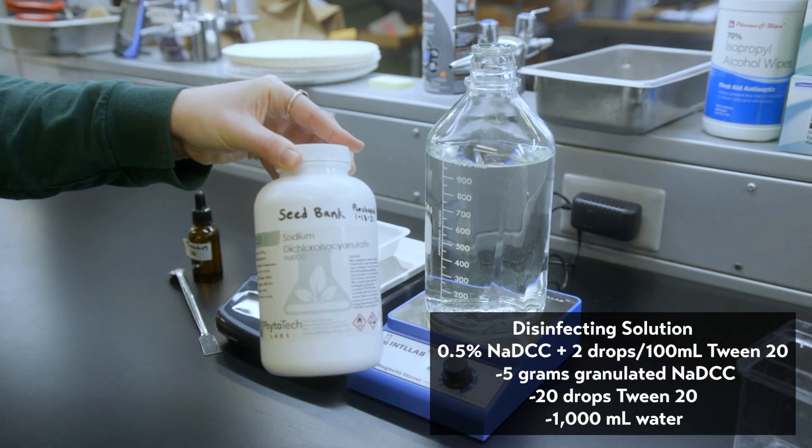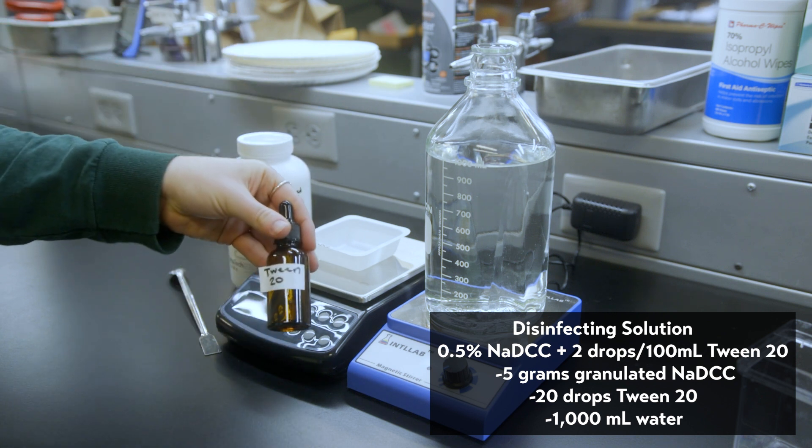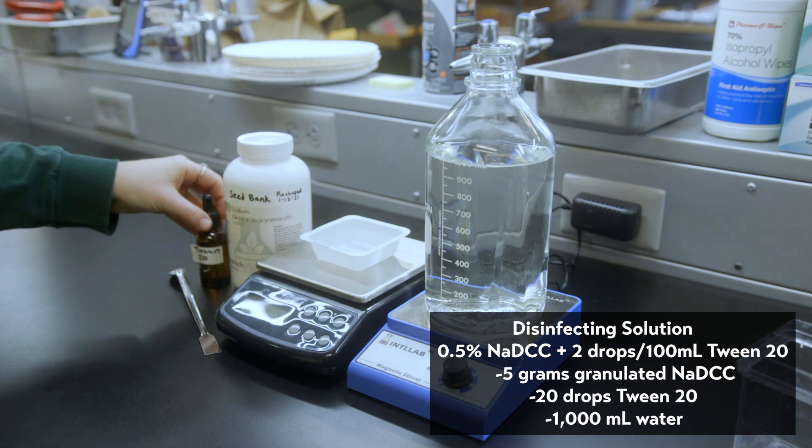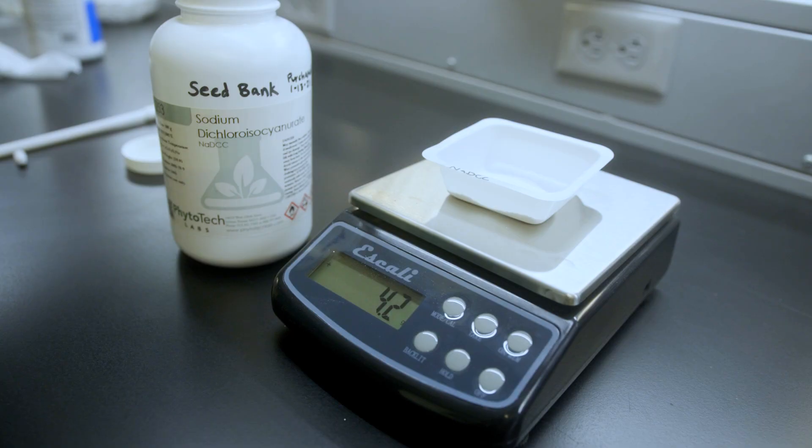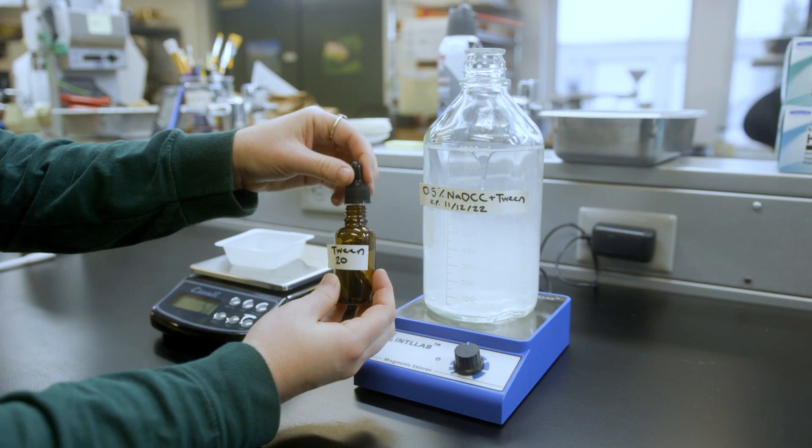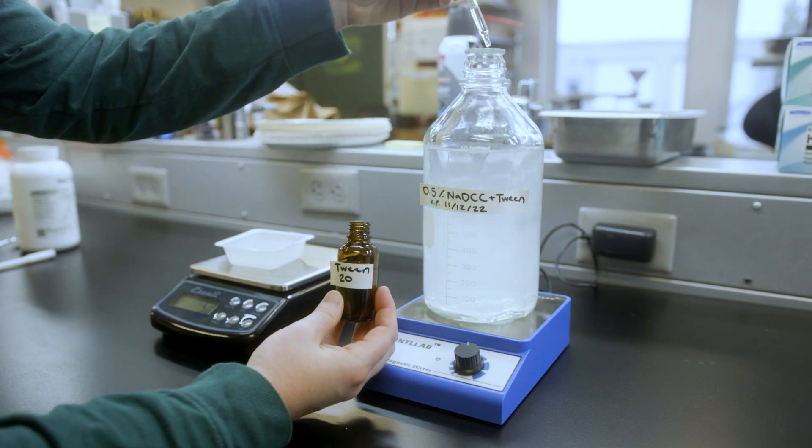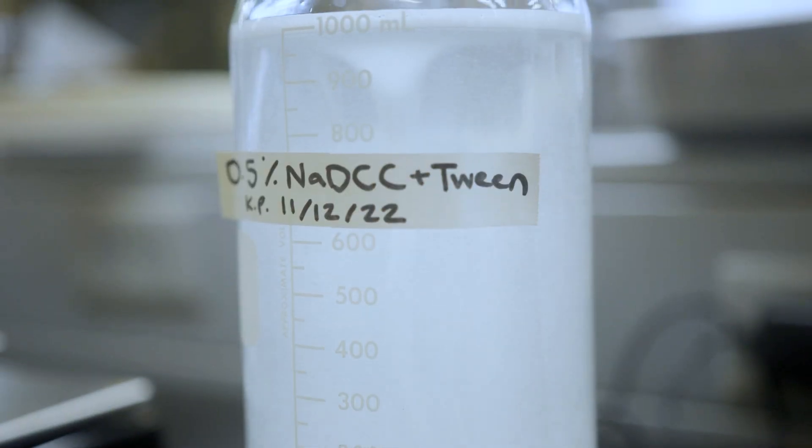Next I prepare my disinfecting solution. I use NADCC with Tween 20. This is mixed in 1,000 milliliters of water and labeled. 5 grams of NADCC is mixed with the water on a stir plate. 20 drops of Tween is then added. This will give you a 0.5% concentration of NADCC.